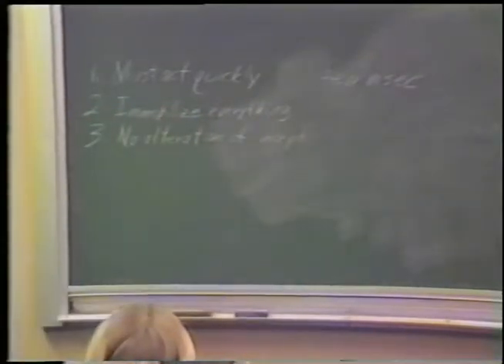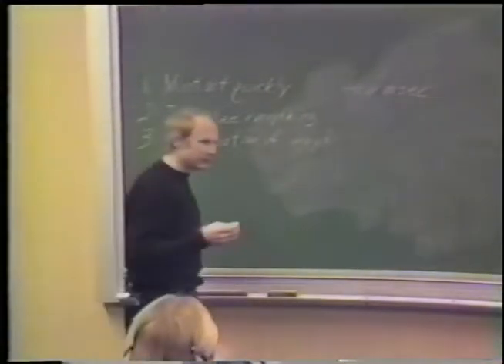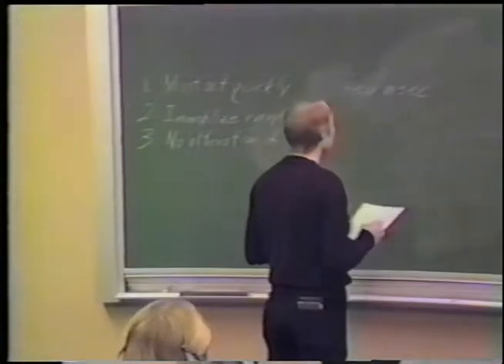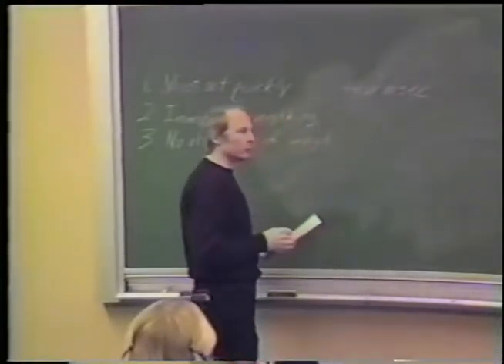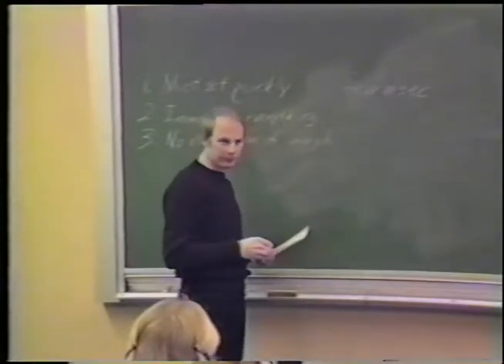You have to have everything frozen in a few milliseconds or you're going to get ice crystal movement. Like 3 to 5 milliseconds at the most. And it's been confirmed that the freezing occurs within this time period, in some cases within a millisecond. Depends on the sample and the method that you're using.